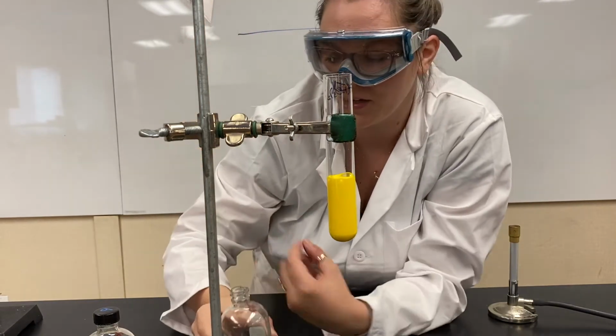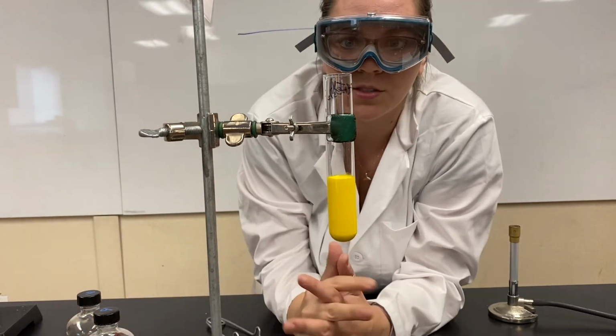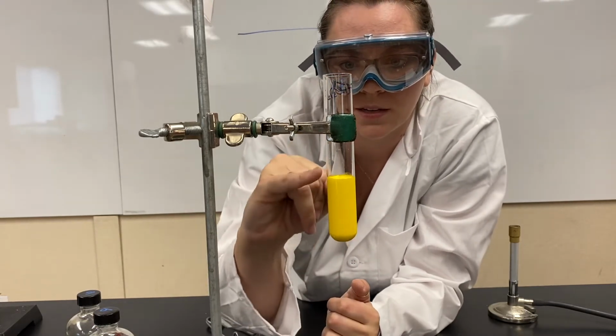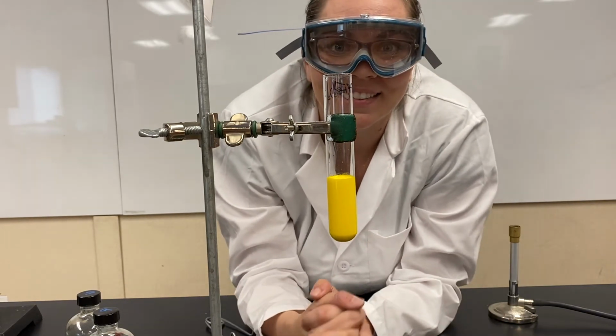Ooh, okay. So we clearly make a precipitate, we make a solid. So this is what lead(II) iodide would look like, because that's going to be the solid that forms in here, which I guess is one of the answers to your lab, but here you go, exciting, okay?